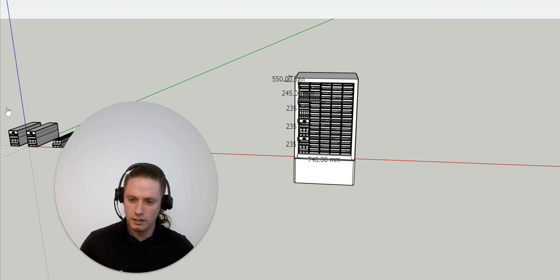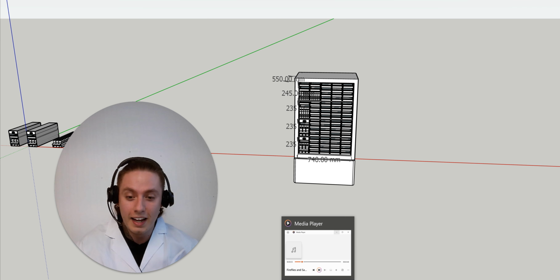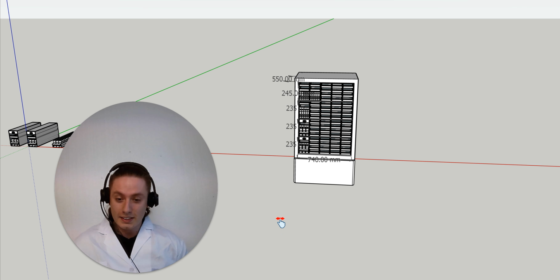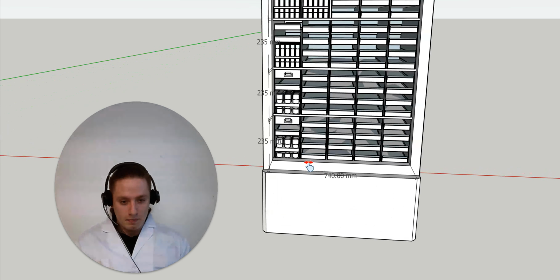Actually, let me go grab something. Well, that's more like it. Let's always wear our lab coats in the lab, and the cryogenic gloves if we're going through the -80 freezers, just to stay on the safe side. So, here we go. Back to it.